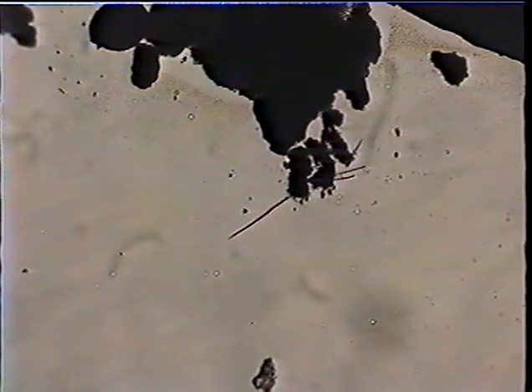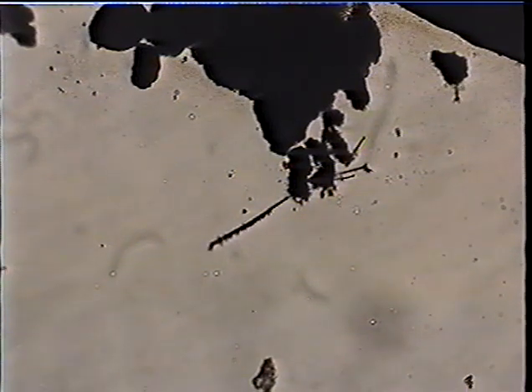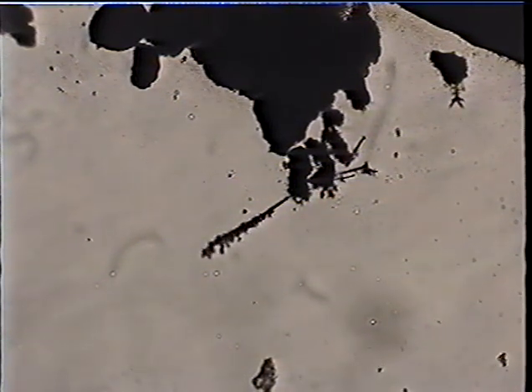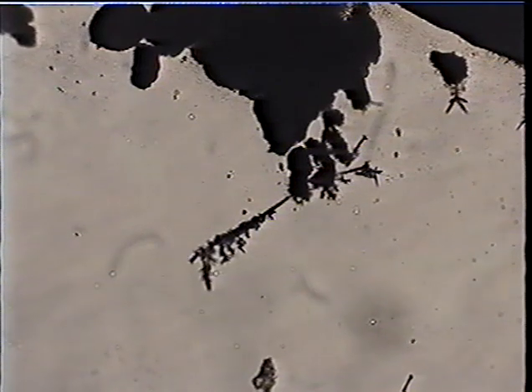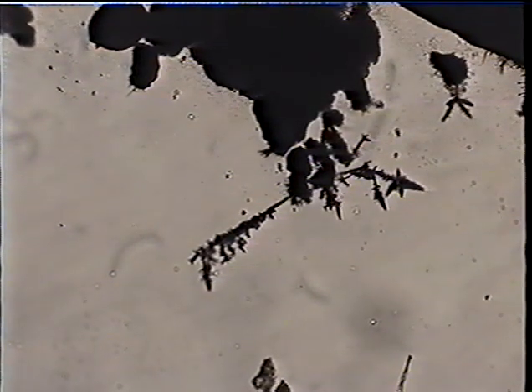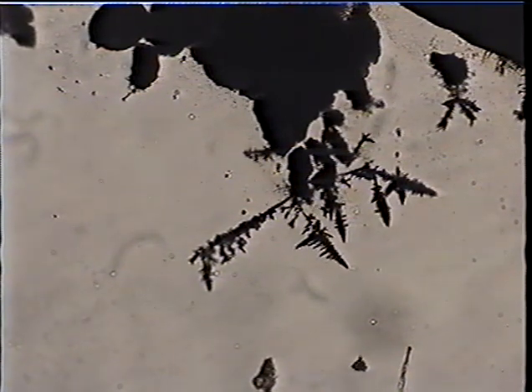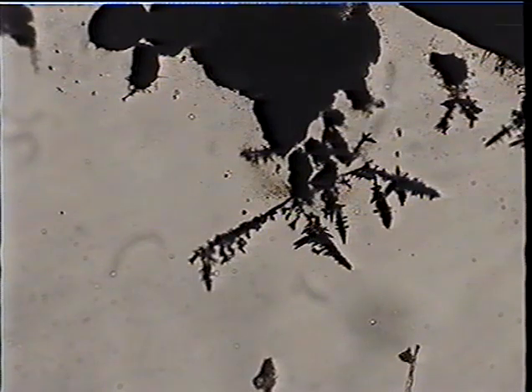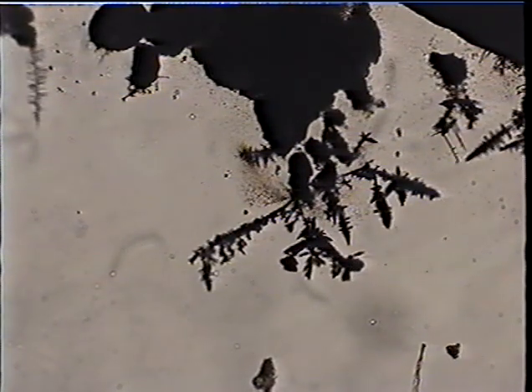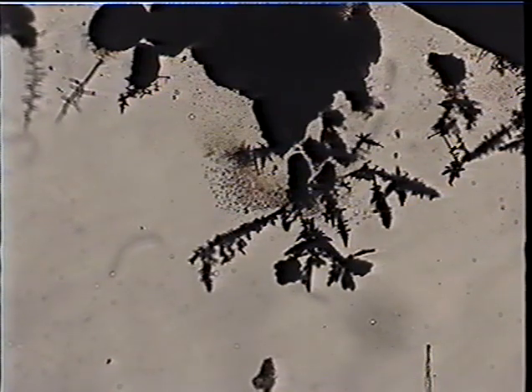These are going to be crystals of a metal itself. Lead, in fact. We have here crystals in the top of metallic zinc. And because zinc is higher in the electromotive series, more active than lead, it will displace lead from solution. And you can now see crystals of lead actually growing in the droplet of water.